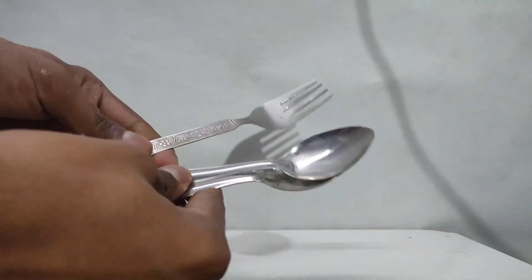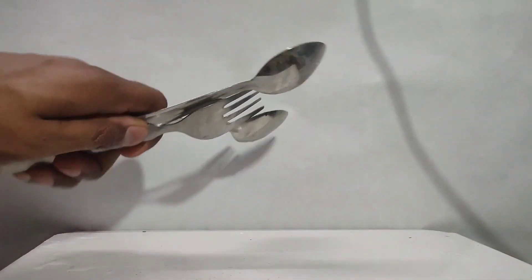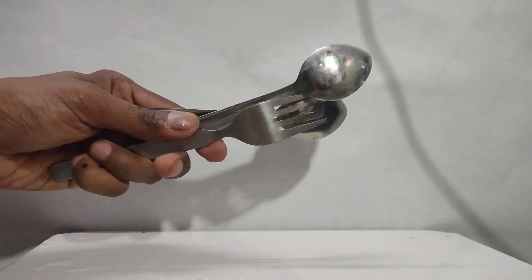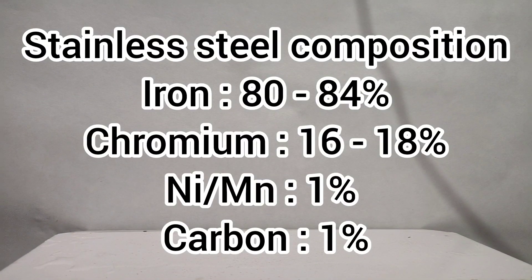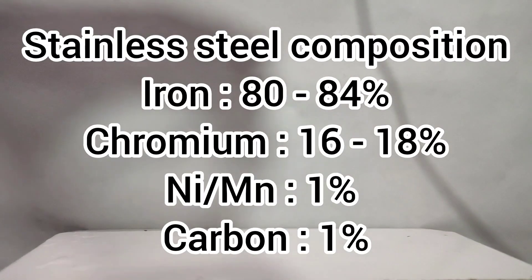In this video, I will be making potassium dichromate from old cutlery which is made up of stainless steel. Stainless steel contains around 16-18% chromium. Taking this into consideration, I have made all the measurements.